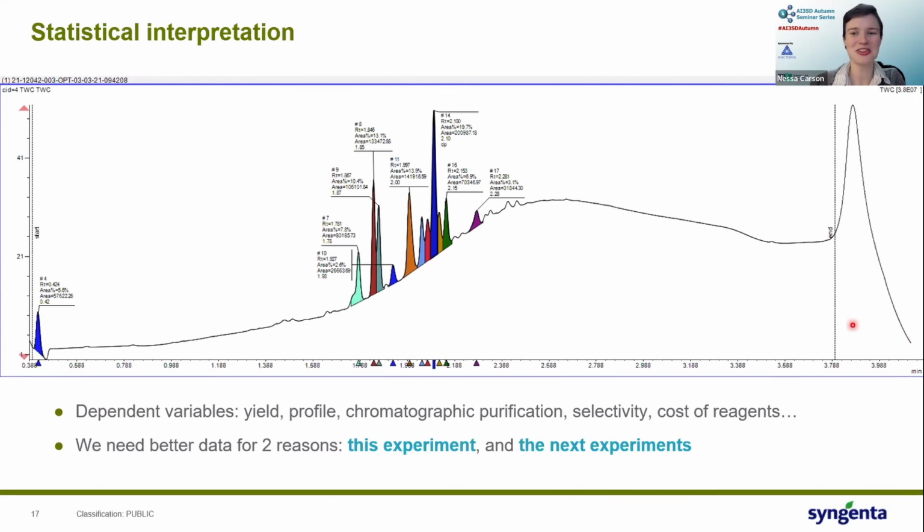So yeah, I think understandable by computer definitely requires some level of standardization. We don't like data dumps. We see a lot of data dumps. Honestly, my biggest piece of advice is don't just dump your data into a massive folder on the LCMS. Please have some kind of metadata curation. Any kind of auto curation is always really good news as well, because we don't want to waste chemists' time, and chemists do not want to have their time wasted. So any kind of automatic curation is good news. And that's also something that I've tried to build into the Python script I built. So hopefully that will be passed on to more further reaching projects that work for everybody.